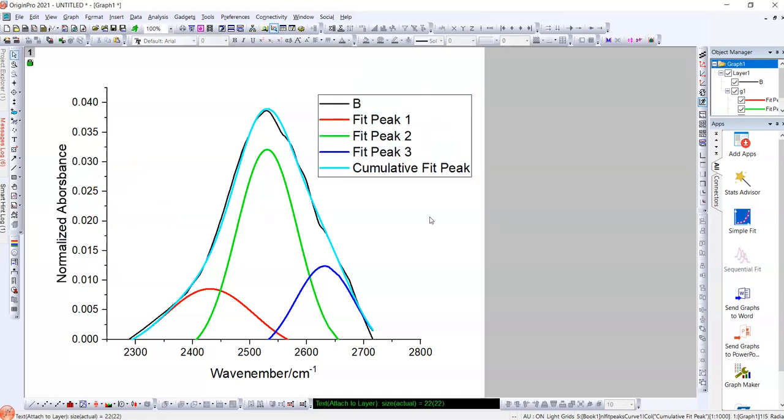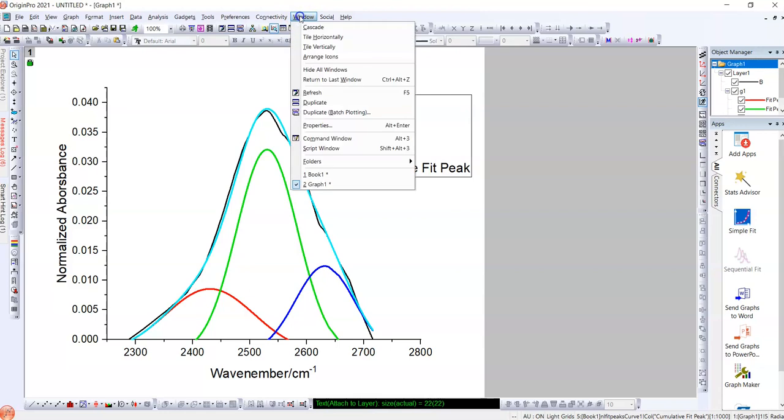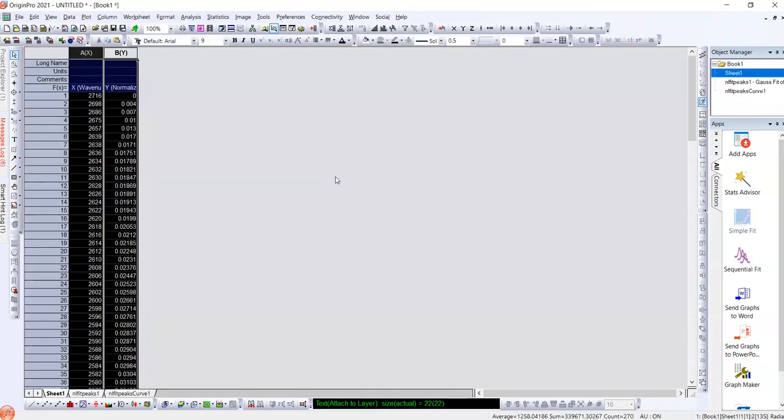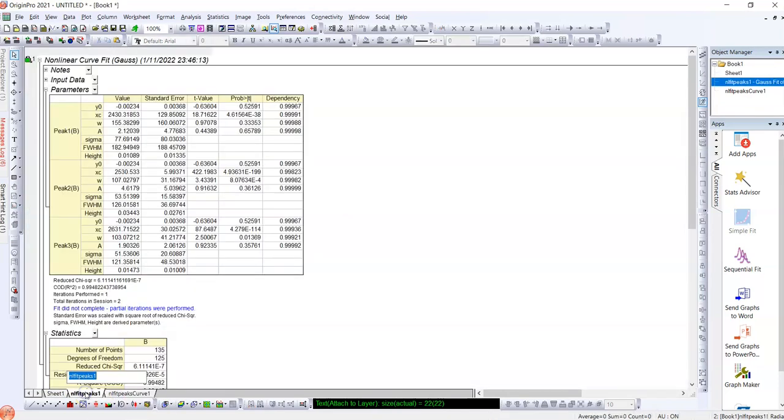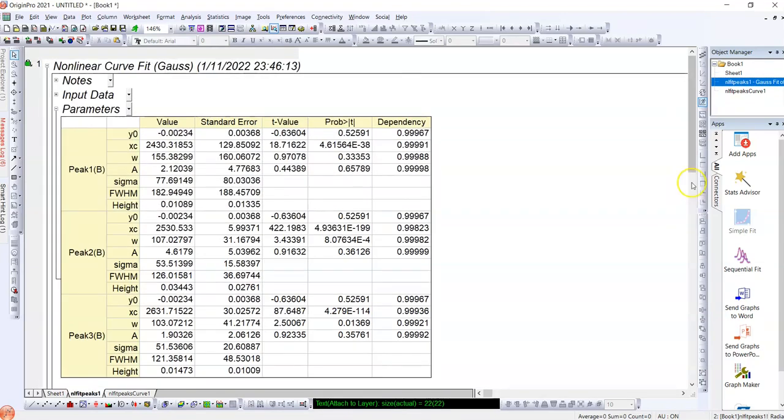If you would like to see the data of this individual curve, we go to the Windows, to the book, and here. We put down here. This will show us some parameters and how could you fit this.